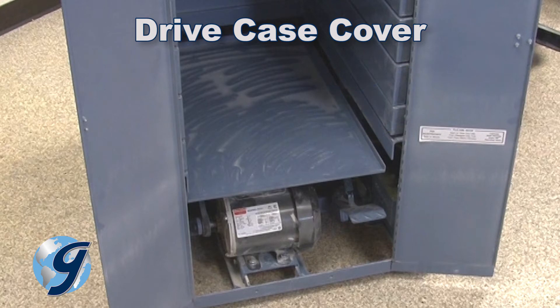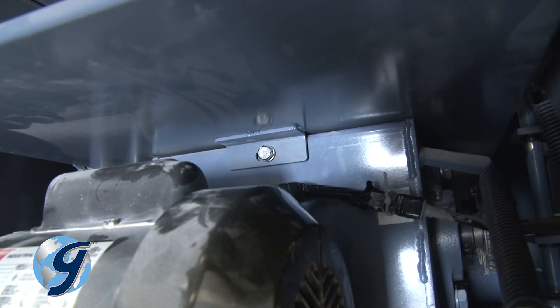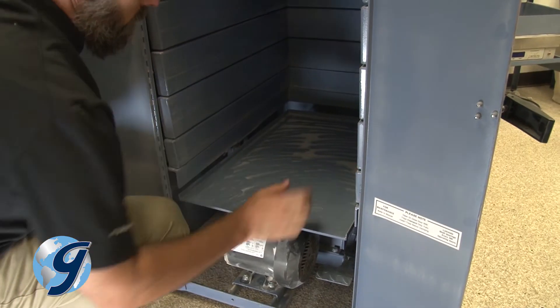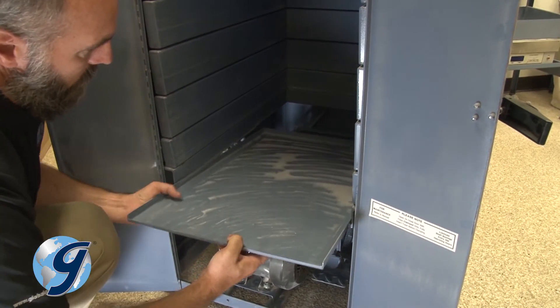To remove the drive case cover, from the front of the unit, reach under the drive case cover, and at its rear center, locate the mounting screw. Remove the screw, slide the drive case cover towards you, lift it off, and set it aside.